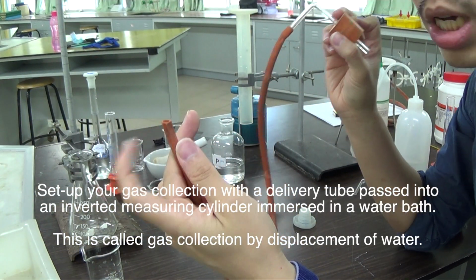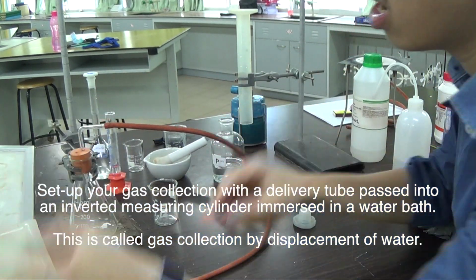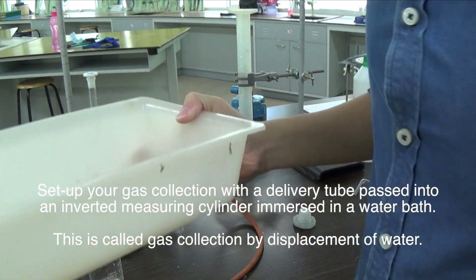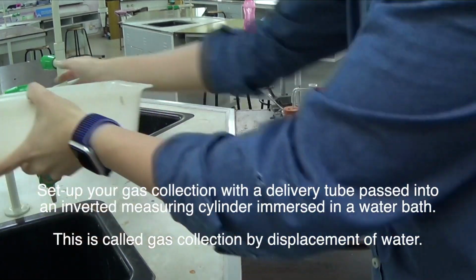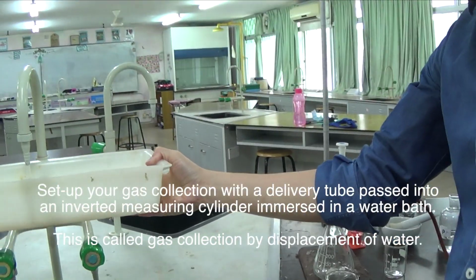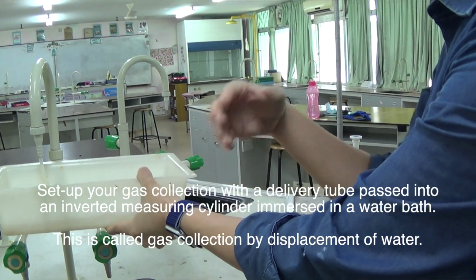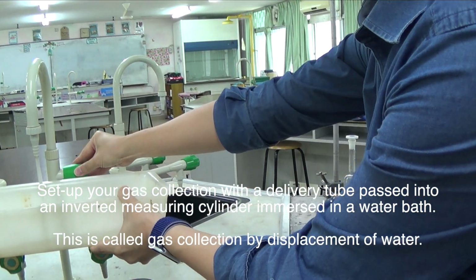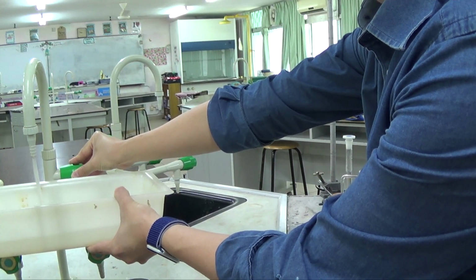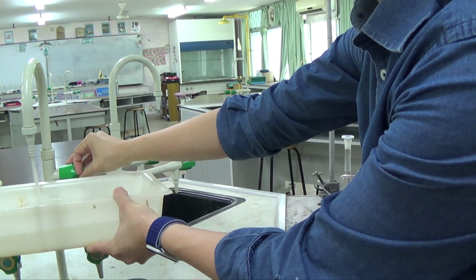I need to measure the volume of the gas produced, so we're going to collect the gas by using displacement of water. So I fill up my container, my water trough, with just tap water. You could use any sort of water trough that would be sensible, but the water level needs to be high enough because of what we're going to do after this.